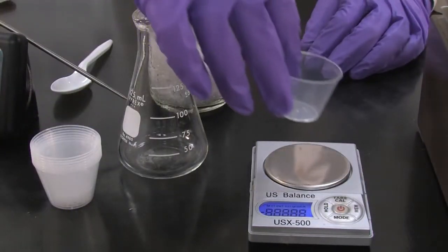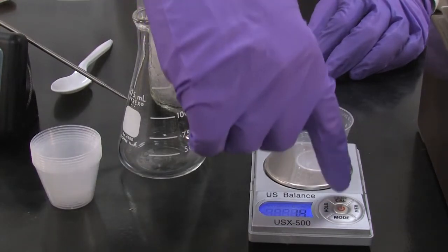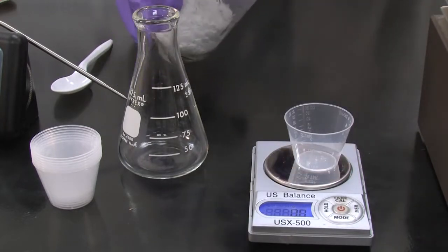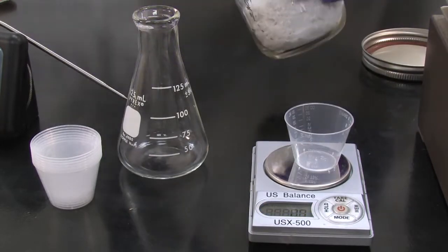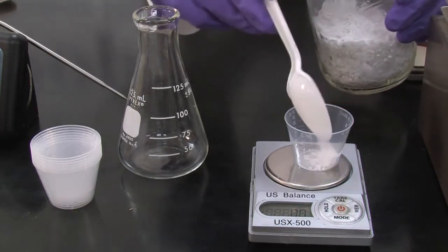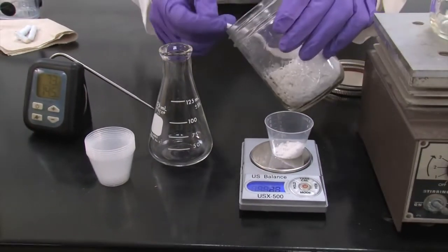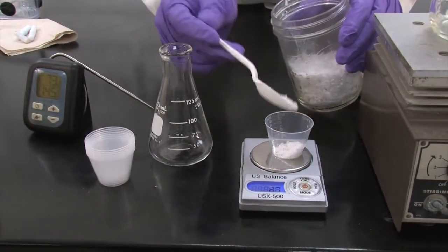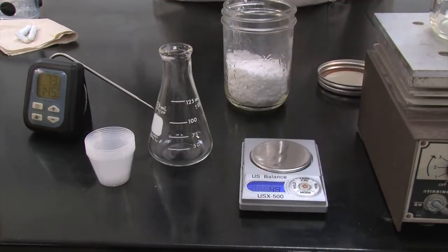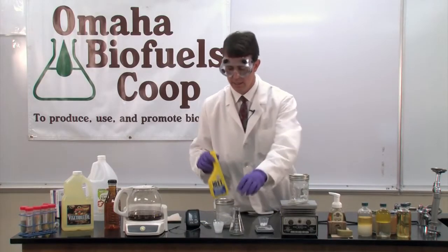We'll add a weigh boat to the scale, and tare, or reset the scale to zero, and then weigh out 4 grams of the catalyst lye. Next, we'll measure 50 milliliters of the methyl alcohol into our flask.